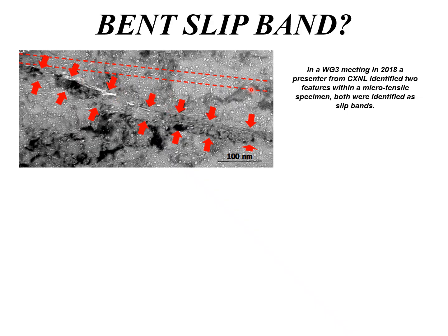It was the same argument that Garner had about channel fracture. So you have this bulk shear, which could be twinning or a localized slip band, doesn't matter. It's a bulk shear occurring. And that was associated with the cracking, whereas really it was the twin martensite platelets that were associated with the cracking, and this was just secondary.